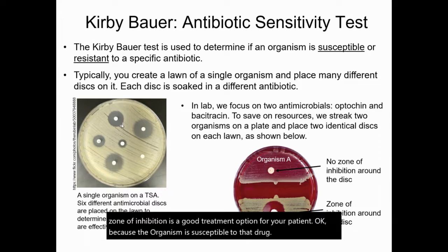All right, so to recap, in the real world setting, you would have an idea what your organism is, and you'd be trying to find which treatment options are the best. Now, it is possible that you may not know what your patient has, but you may still need a way to treat it, right? And so you want to get that bacterial growth under control.